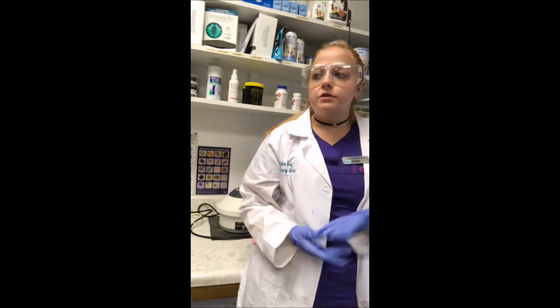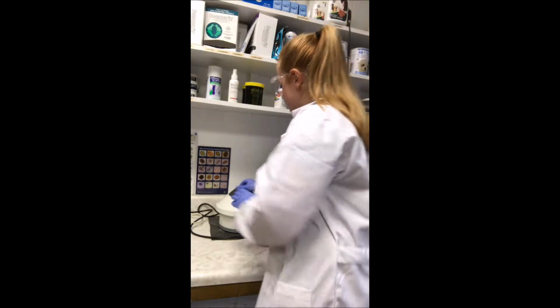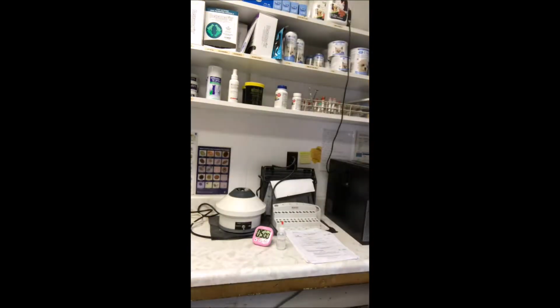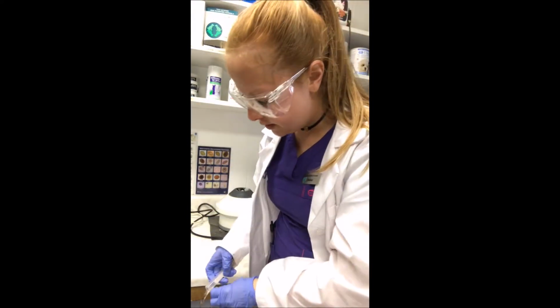Okay, so our centrifuge has been spinning for 5 minutes. We're going to go ahead and take it out, take another second look at them, and we're going to keep it. Okay, and you can see the sediment down at the bottom. So we're going to go ahead and decant this. Literally, I'm just going to pour all this into the garbage can.